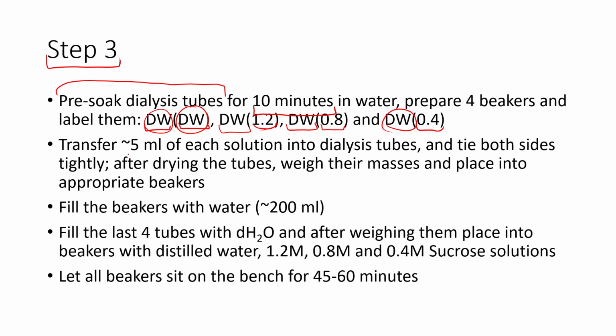Then we take about 5 milliliters into each of these dialysis tubes. Then we close both sides of the dialysis tube so that nothing leaves it. And after drying these tubes, so we remove all the liquids from the surface, we determine the mass of each of them, and after that we transfer these tubes into the beakers.